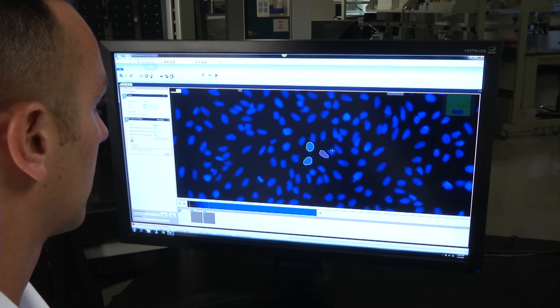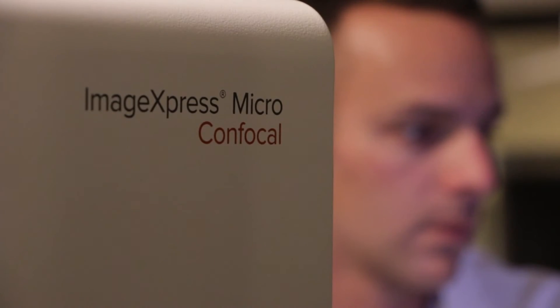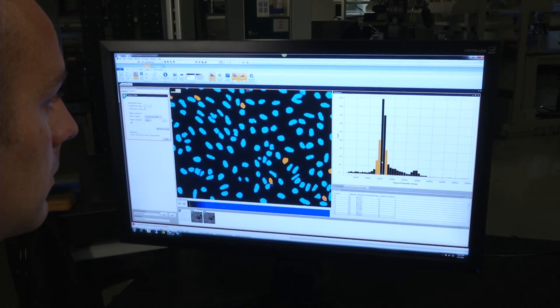The ImageExpress Micro-Confocal System is a complete imaging solution for researchers and screeners. The system enables you to acquire the image, store the data and import third-party images to more effectively analyze the images and data you mine.